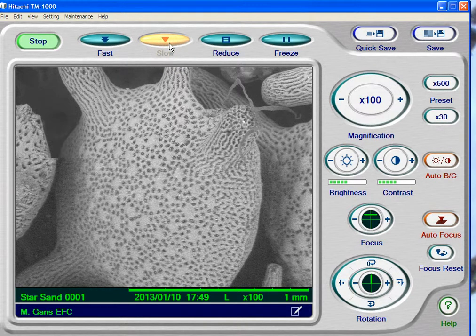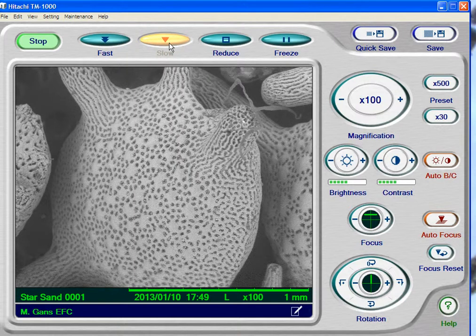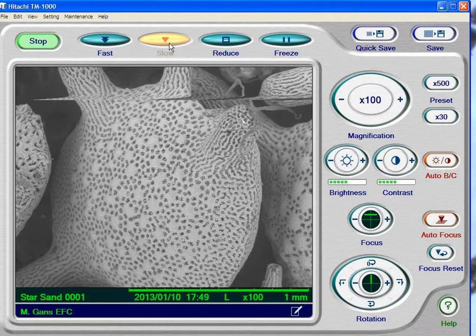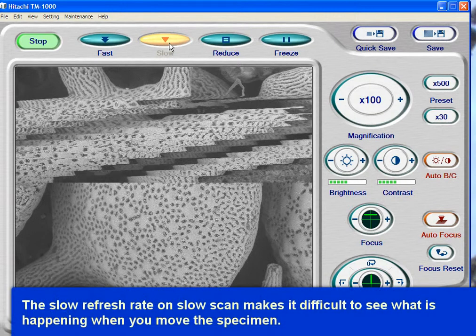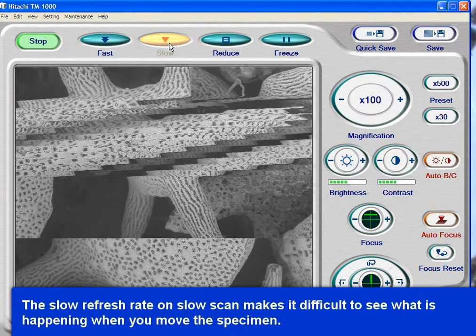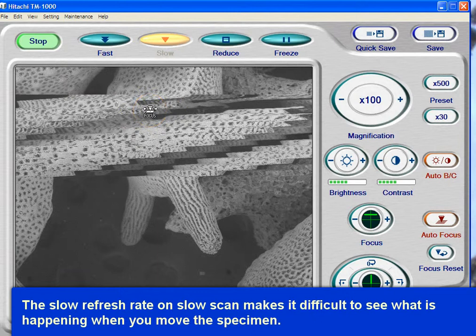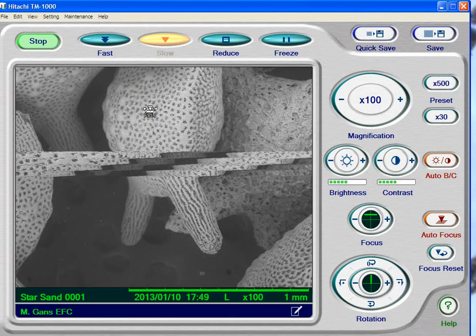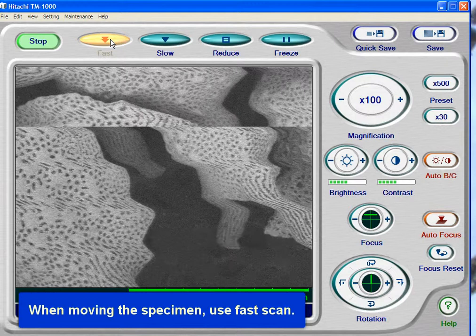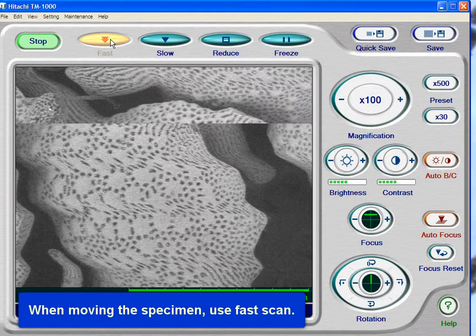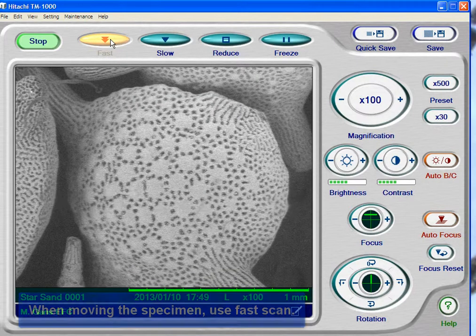The other reason is this. I'm going to reach over to the scope here and physically move the knob. So on slow scan, I'm going to start moving that knob, and you'll see that it's a mess. It's really hard to tell where you are because this part of the picture up here isn't going to refresh until the line goes back through. So the refresh rate is really, really slow. If I go to fast scan, you can see that since it's refreshing faster, that allows me to actually see what's going on.